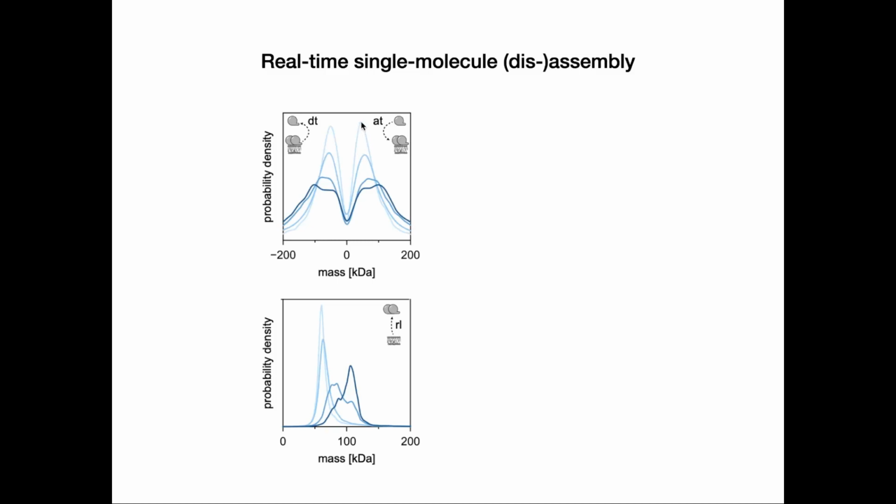So in this graph, light to dark means increasing protein densities on the bilayer. And so if we increase the concentration, or the crowdedness of the bilayer, you can appreciate that also the complexes that are attaching and detaching from our molecules are getting bigger.